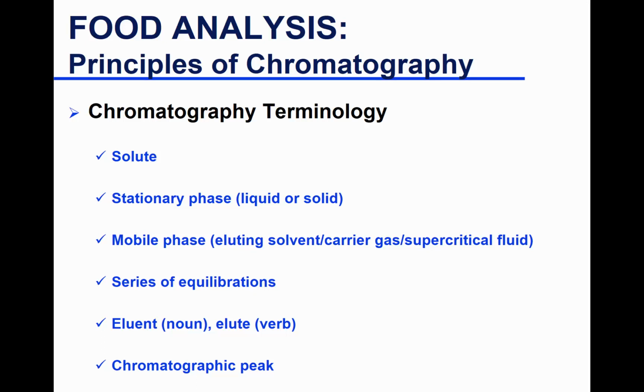Or at the most concentration. So of course here you will have the most concentration in the center of the peak, because we're going to talk about diffusion within the column and longitudinal diffusion, how the component moves. We'll talk about that at the last lecture in chromatography. So the middle is when you have the highest concentration. So the highest concentration will have the highest absorption.